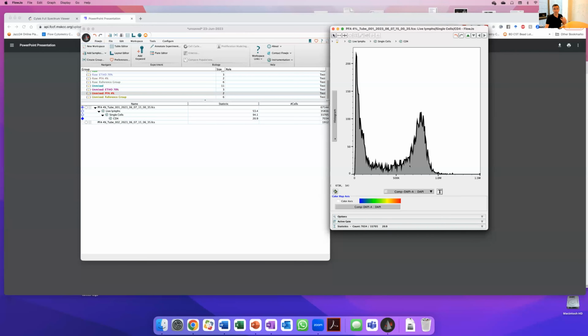Well, the thing is, here in terms of staining, the fixative, there was a lot of conversation in terms of how much fixative, and it's not only how much should we add, also how much time should we add. In this case, we didn't optimize the protocol. So Anne and Barbara prepared these samples, and as you can see, what they found was that we weren't able to really stain all of the cells here. So here would be, maybe playing around with the fixative, the amount of fixative and time, also the permeabilization step.